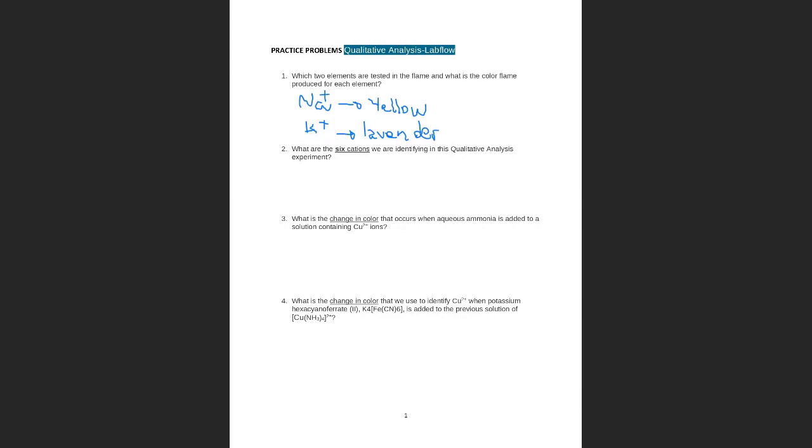Excellent. Okay, so we remember that these are similar to what you are going to encounter when you start doing the pre-lab quiz. And then you will have to remember some other things that we briefly talked about: the yellow of the sodium is very persistent and sometimes can contaminate.